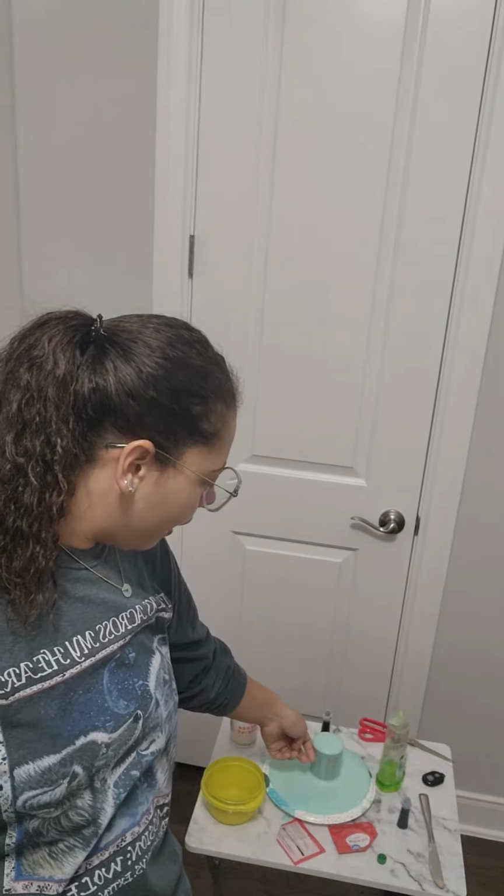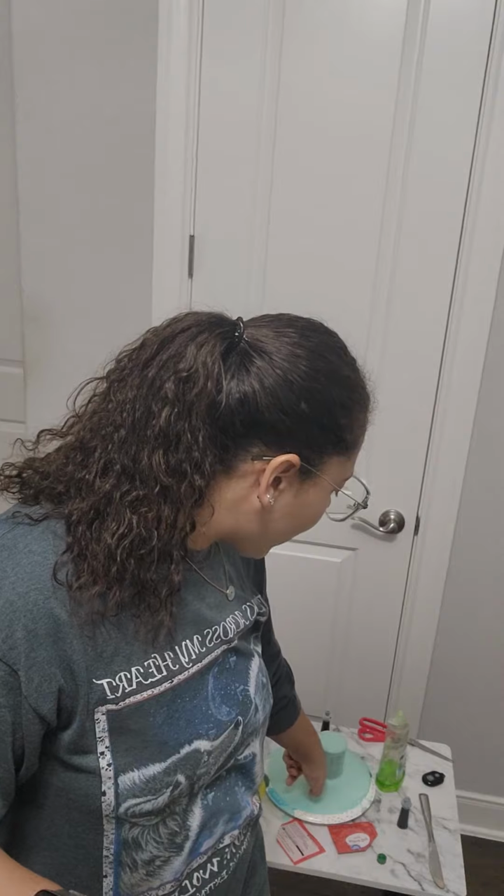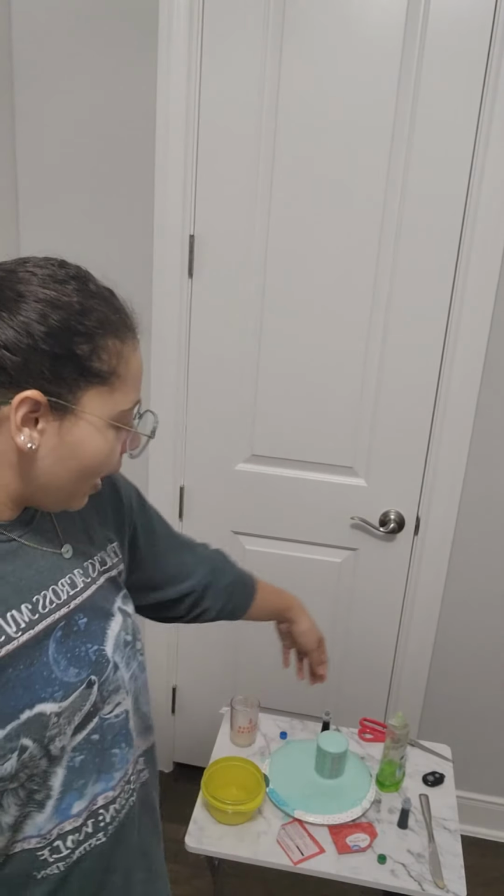Obviously, if I had used a higher concentration of hydrogen peroxide, I would have gotten a more exciting exothermic reaction. If I touch the glass, I can feel the heat coming off of the glass from the reaction being exothermic. But we have our fun colored foam here now, and I made a mess.